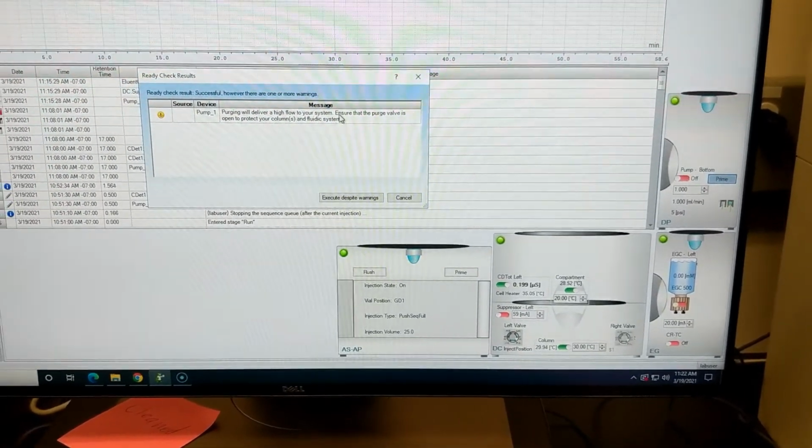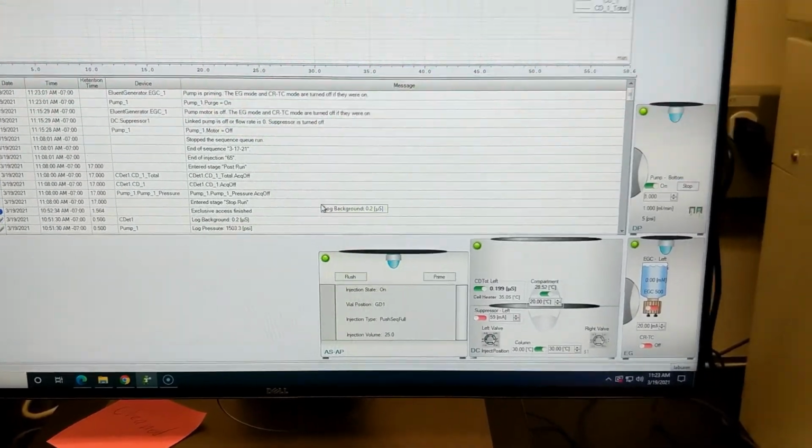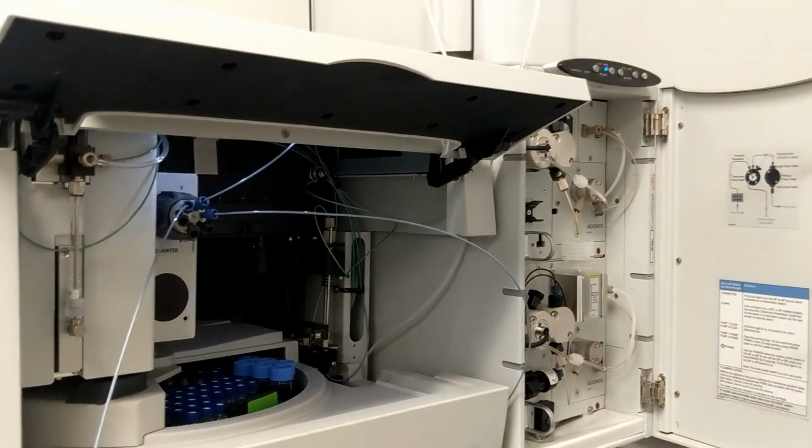Purging will deliver a high flow to your system. Make sure that the purge valve is open. We just did that, so I'm going to say execute. You'll hear that noise. And now it is priming.